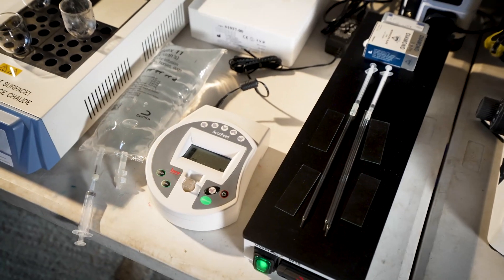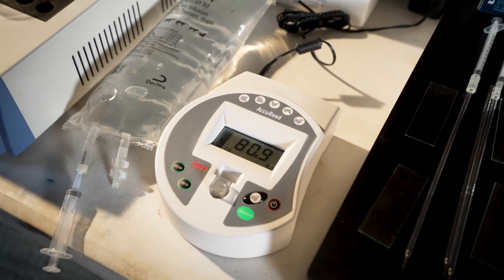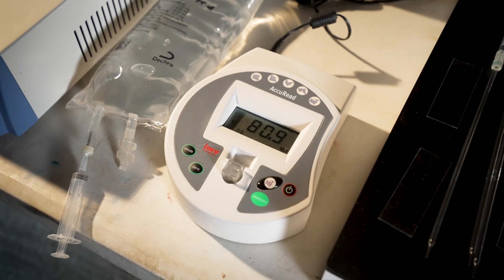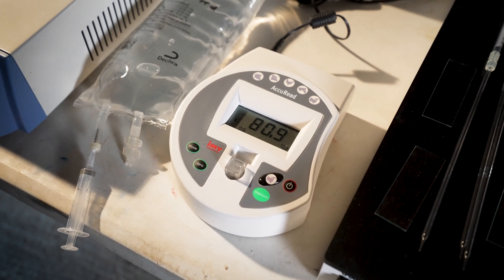Big moment now — press measure and see what comes up. That's not bad, not bad for a young one. In here we've got 80.9 million sperm cells per mil.